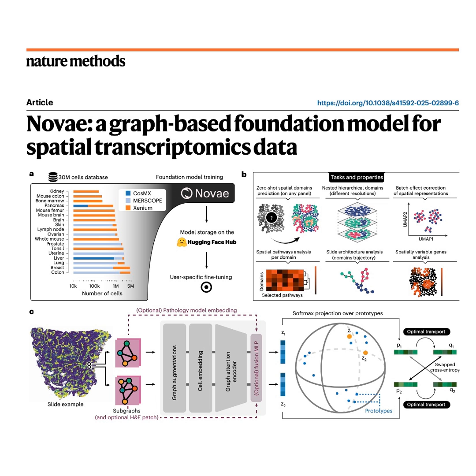This foundation model approach is incredibly powerful for biological discovery, especially when you're dealing with degraded or partial data. We saw Novae was robust, but its performance did start to drop when about 60% of the tissue or gene expression was lost. Considering that the model can pinpoint disease pathways and structural changes using these foundational domains, here's my final thought for you, the learner, to mull over.